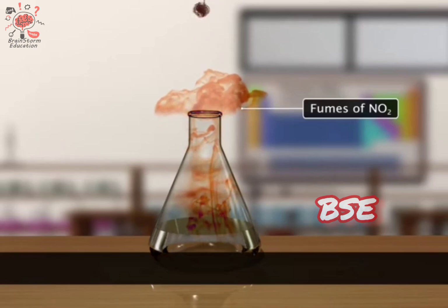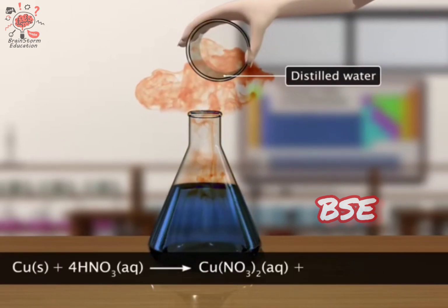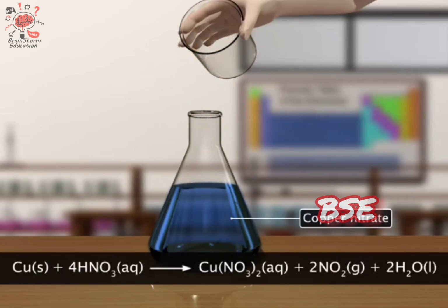When the solution is further diluted with water, it develops into a blue solution of copper nitrate. Copper is oxidized and nitric acid is reduced in this reaction.